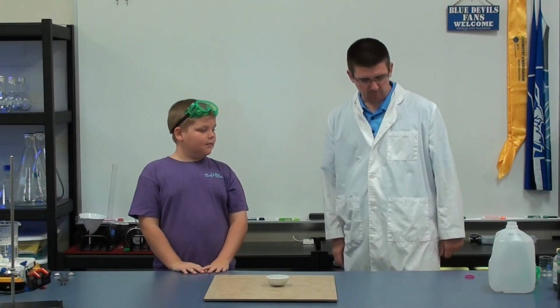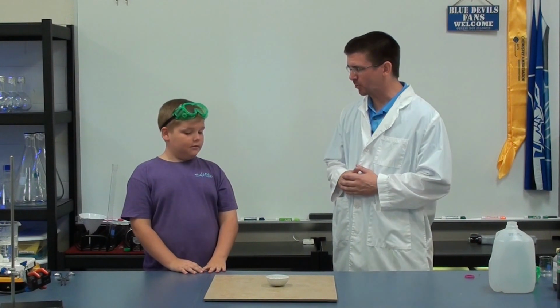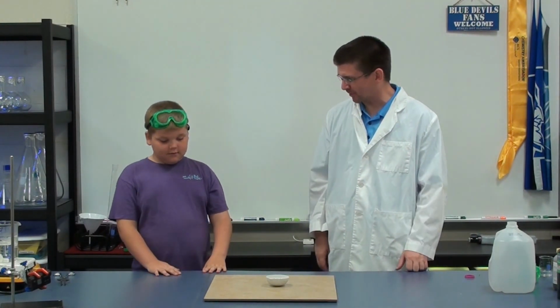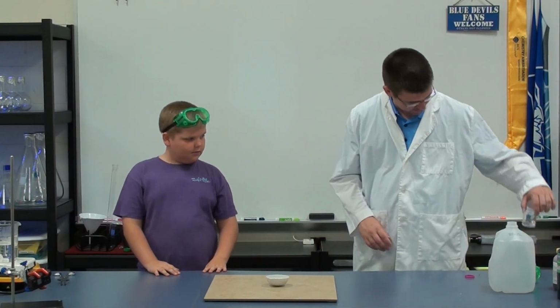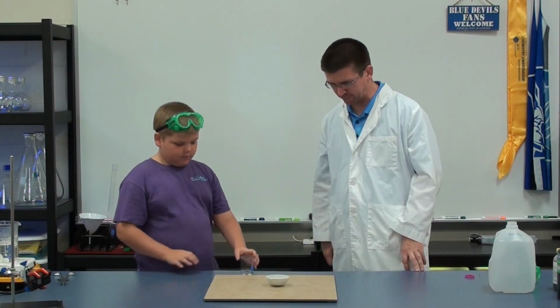All right, well, Lawson, we're going to look today at how alcohol burns. We know it's a flammable liquid, right? Mm-hmm. And we know if we light it, it'll burn, and we know we can make it explode and all kinds of things. But I've got 20 milliliters of alcohol there. Just add that to our evaporating dish there.